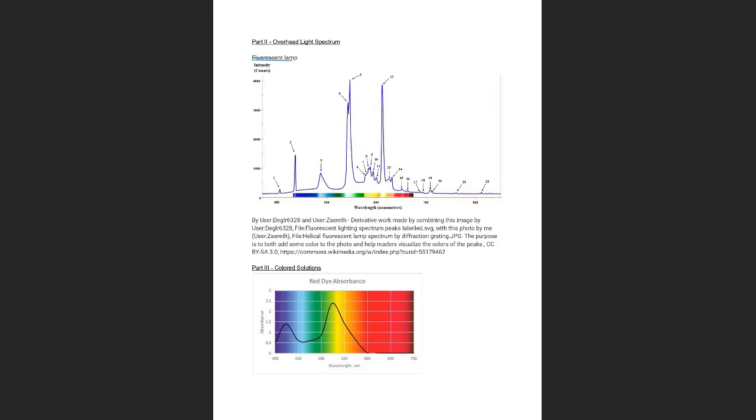because there is always light intensity, and there is continuous, there is always absorbance, or emission. So what do you have to do in part 2?